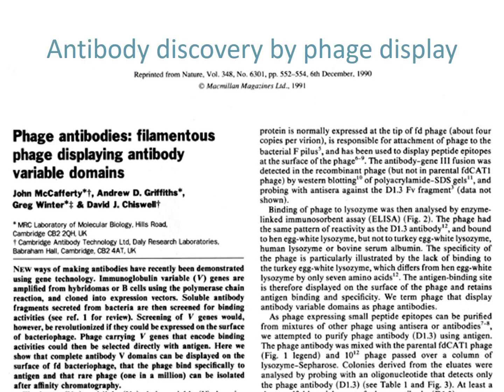So back in 1990, I was fortunate enough to be one of the founders of Cambridge Antibody Technology, now MedImmune Cambridge. And by the end of that first year, we had this paper in Nature describing for the first time the display of antibodies on filamentous bacteriophage of E. coli.